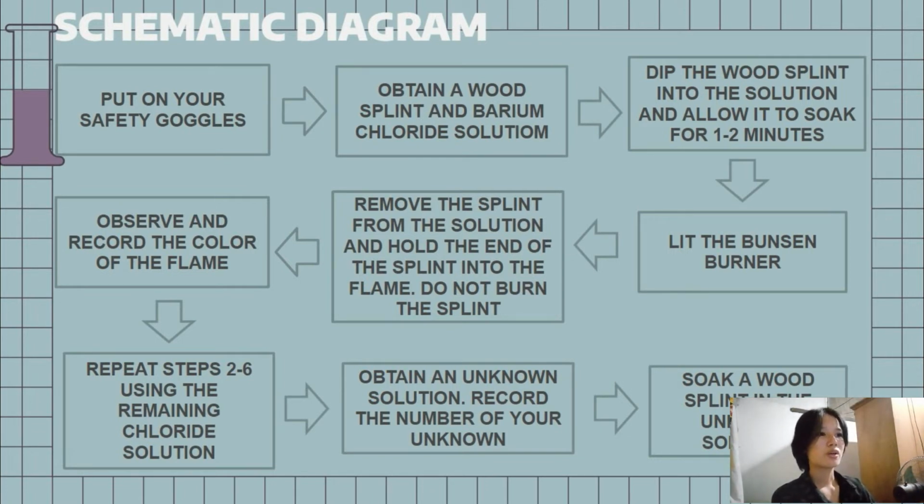After obtaining the wood splint and the solution, soak the wood splint in the solution for about 1 to 2 minutes.